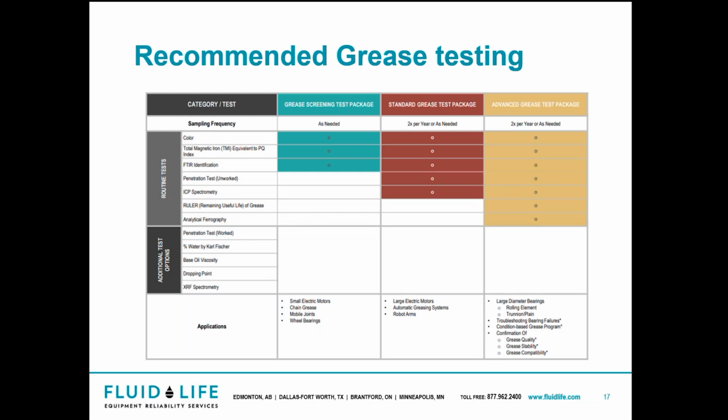So as you can see, the tests we do: color, just exactly what it sounds like. And I'll run through all these tests. Total magnetic iron, FTIR (Fourier transform infrared), penetration tests, ICP, ruler, ferrography, water, viscosity, dropping point, and spectroscopy.